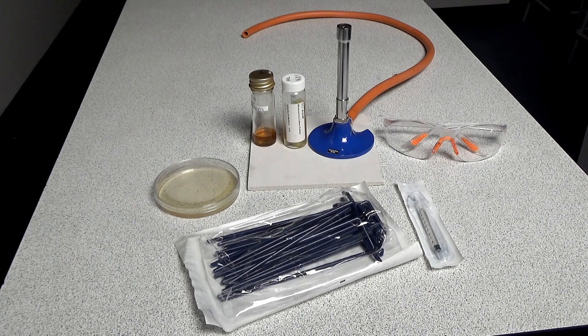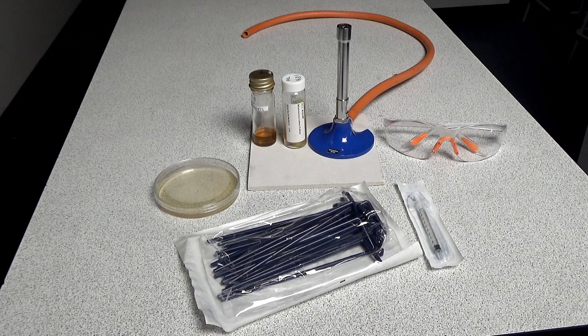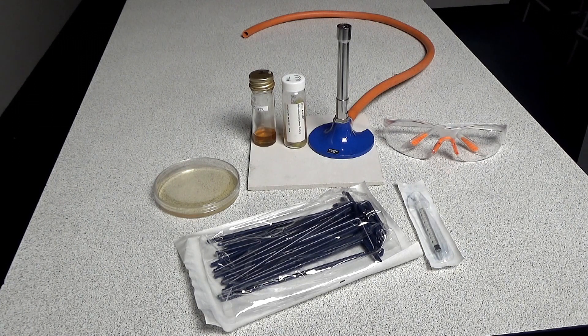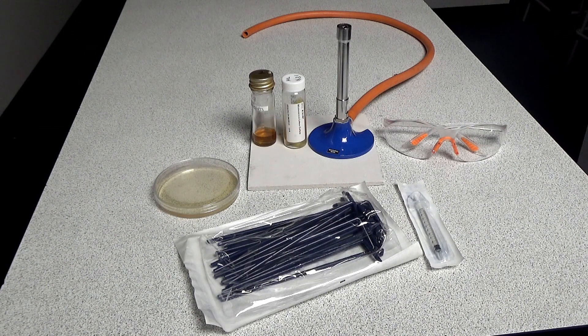For this practical you'll need a Bunsen burner and heat proof mat, safety goggles, a nutrient agar plate, a bacterial culture, a sterile L-shaped spreader and a sterile one milliliter syringe.